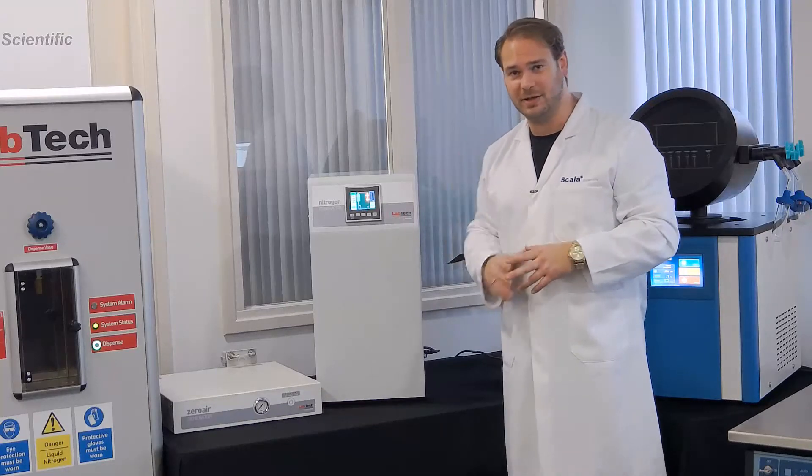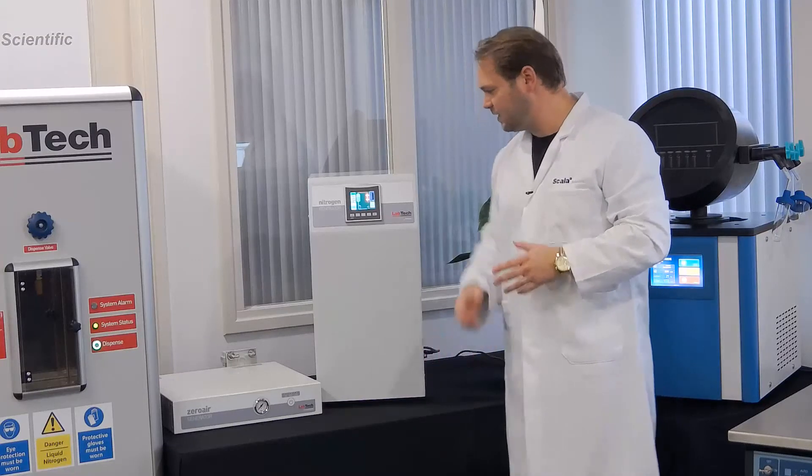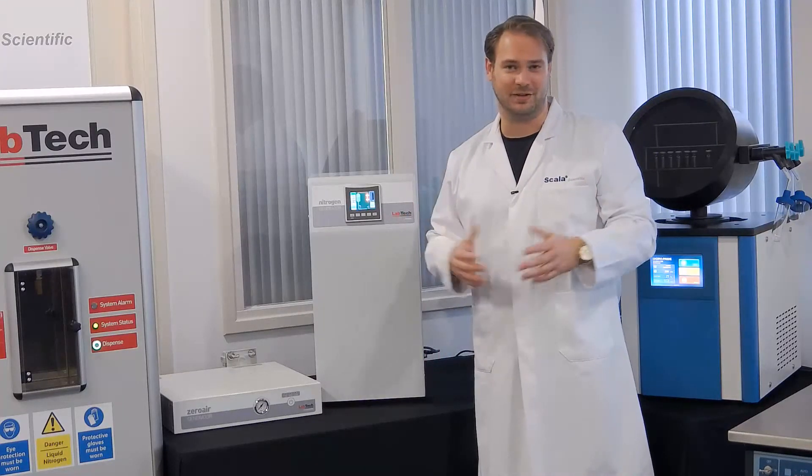It works very easily by just the push of a button. You can connect it over here on the side, and you have your own high-quality nitrogen.